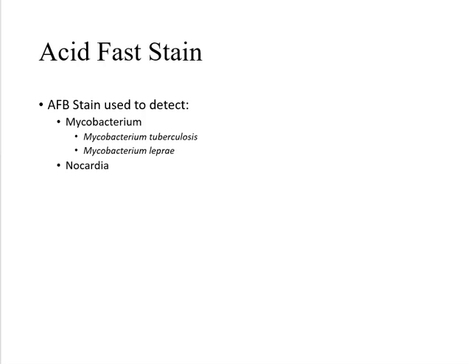leprosy. Nocardia can cause disease, but it's very innocuous. What we're really looking for, and what you're going to see, is a sputum culture with an acid-fast stain. That is almost 99.9% of the specimens that come down to the lab: a sputum culture looking for tuberculosis.